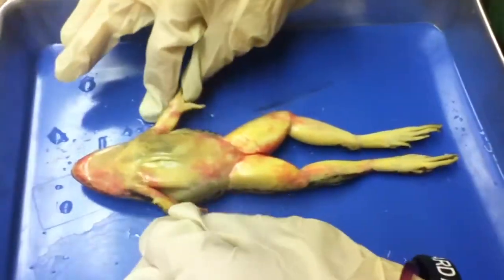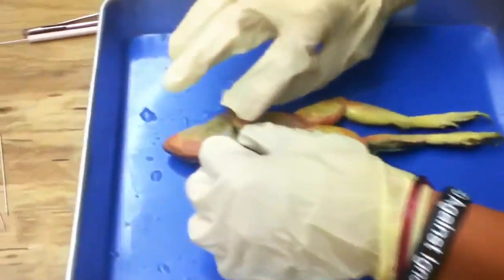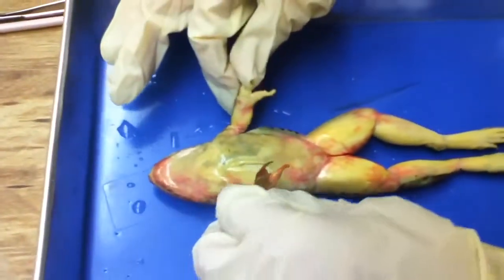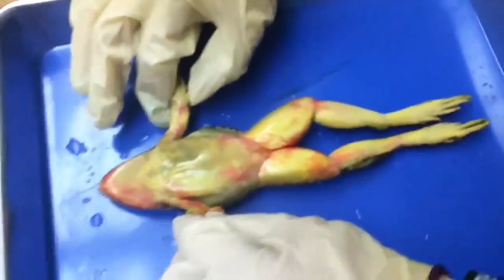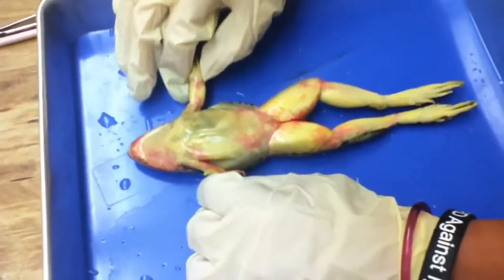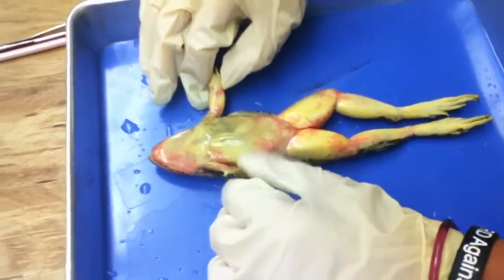Determine the frog's sex. Look at the digits or fingers on its front legs. I think it's male. Stop talking, stop what you're doing. Just a couple things. We take the measurements, we do the measurements in centimeters, not inches. Remember, we measure. Okay, you got the rollers.